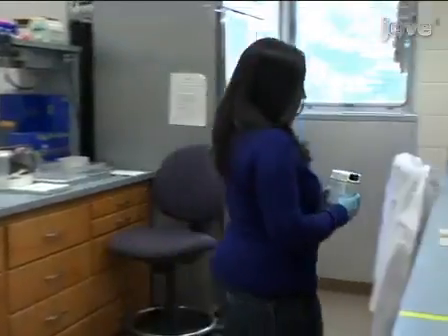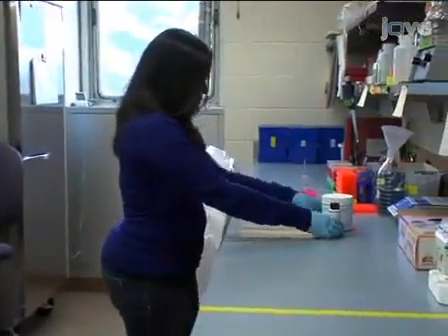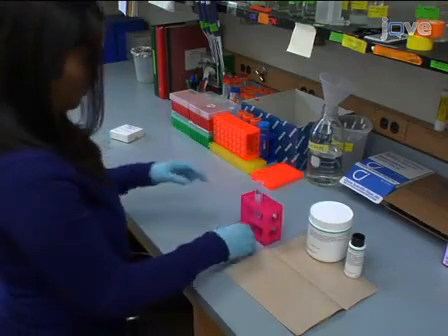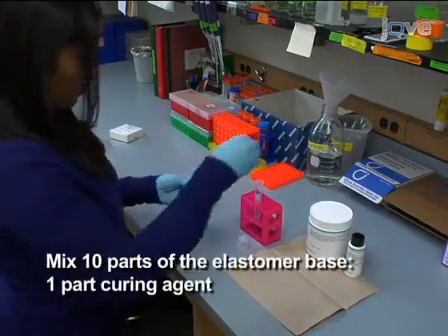To assemble injection slides, first prepare Silgard silicone elastomer according to the manufacturer's instructions. Mix 10 parts of the elastomer base with one part curing agent.